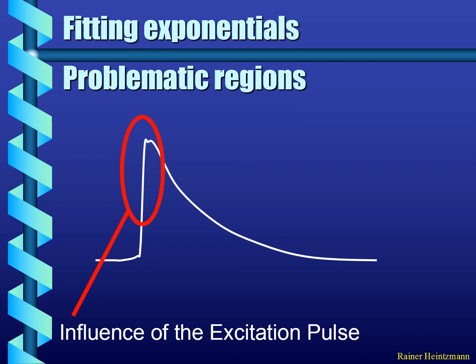So what is called the instrument response function, taking the excitation pulse and maybe the jitter in your detector together, convolves in and is one thing; it convolves the whole curve, which, as we discussed before, doesn't really change the curve in itself. However, if you have a breakthrough of this, so some non-filtered material, you get this extra peak of fluorescence at zero, which is a problem.